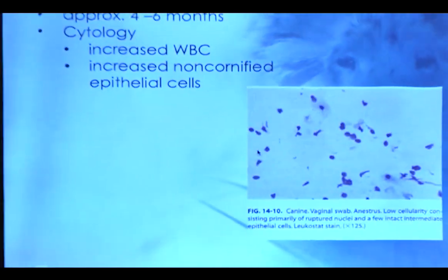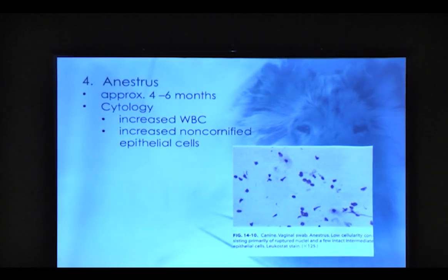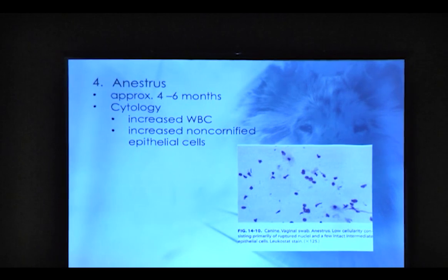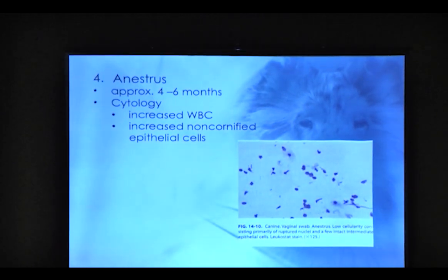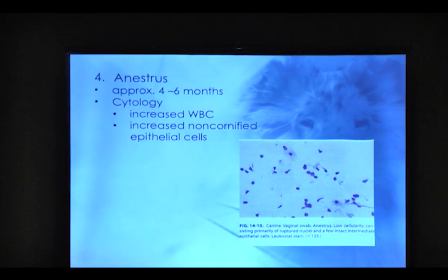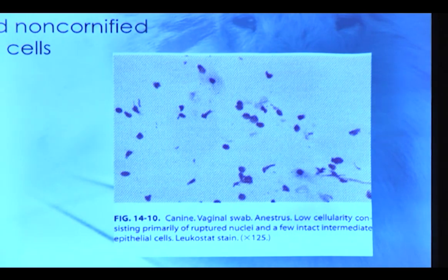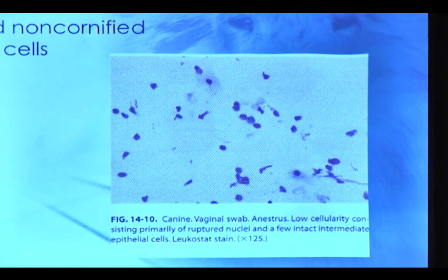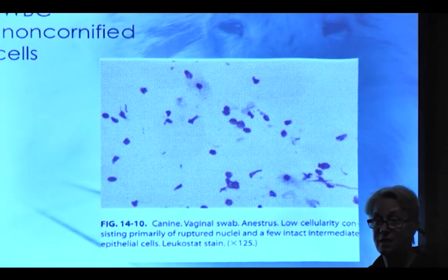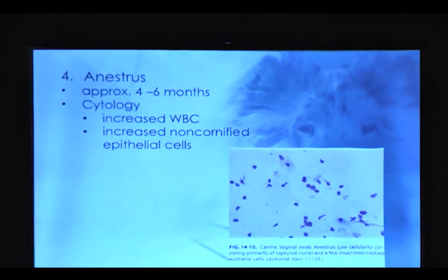So that's this. Anestrus is the period between when you should have been pregnant or you should have been bred. When you're either pregnant or should have been pregnant, anestrus is from that point until your next heat cycle. And it depends on the bitch. Usually it's anywhere from 4 to 6 months. I have seen bitches that go almost a year in between heat cycles. But that's what anestrus looks like. This is a vaginal cytology from anestrus. It just looks like debris. That's all it looks like. Looks like junk. Any questions as far as the slides? Because we're going to be doing them.